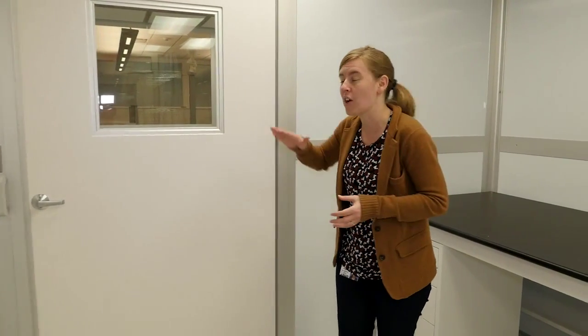And as we proceed through each room, it becomes cleaner and cleaner so that we can finally, in the last 2 rooms, those are the rooms in which we analyze our ancient DNA. We actually pull the DNA out of fossilized bones and other materials in order to analyze the DNA sequences. Those rooms have to be extremely clean, and they're far in the interior.